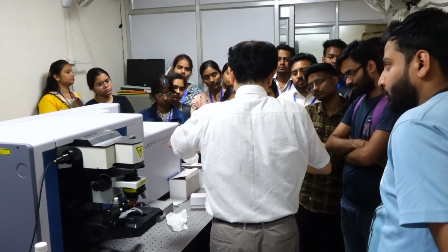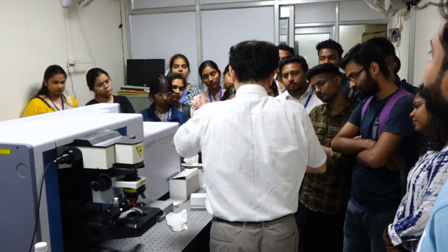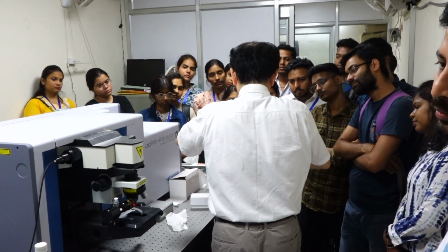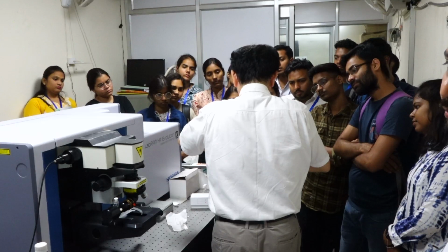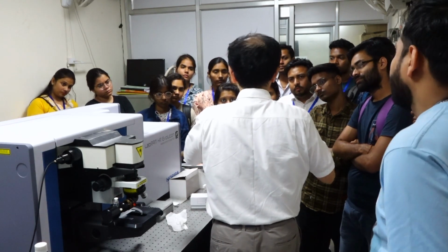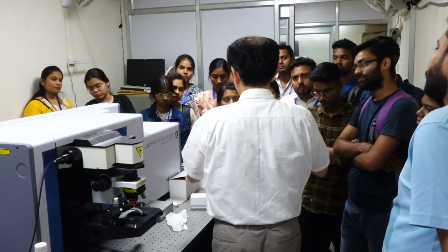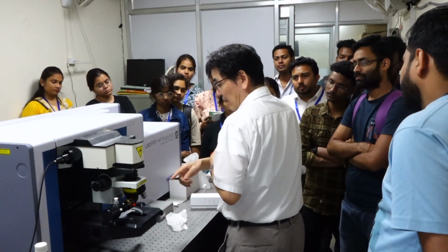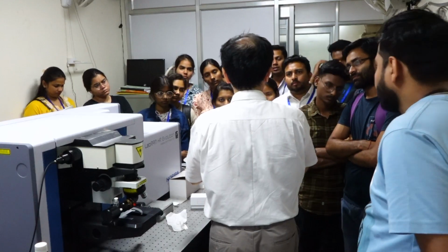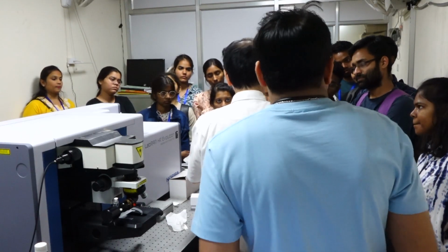If we focus the laser onto a smaller spot, density increases. Further decrease, and the photon density becomes much larger. Accordingly, the Raman signal becomes much larger. So in that sense, tight focus is advantageous to get a larger Raman signal.